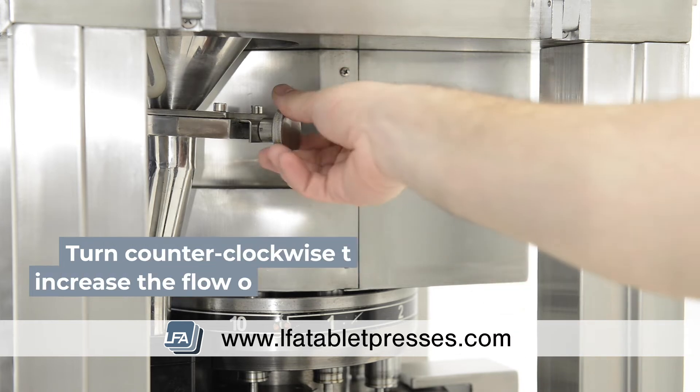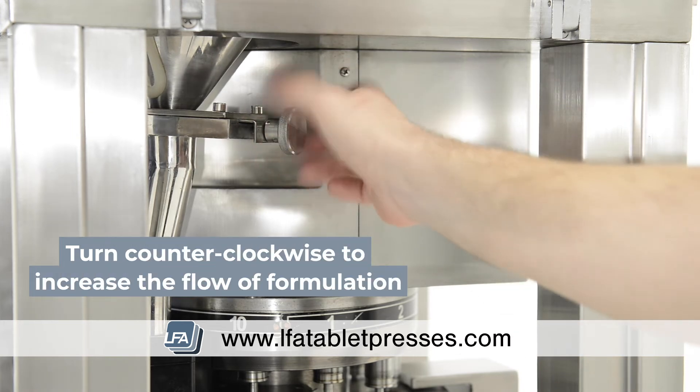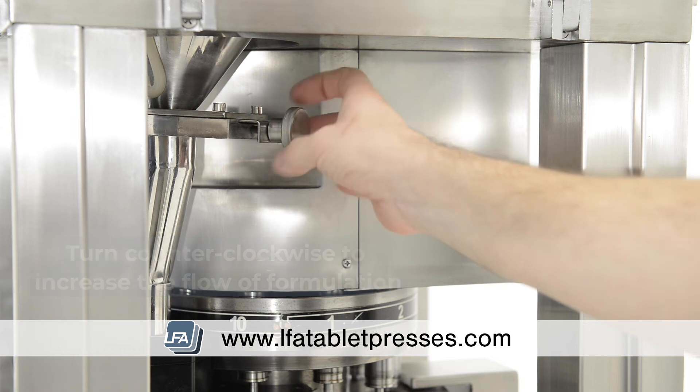Turn the flow adjuster counter-clockwise and this will increase the flow. This is useful if you have a formulation that isn't as granular and may not flow as well.